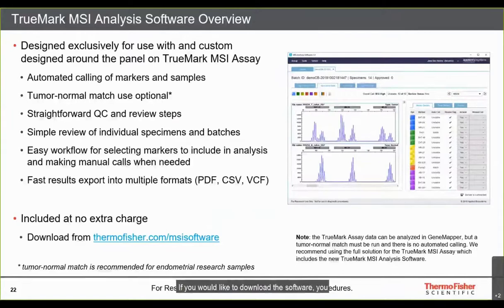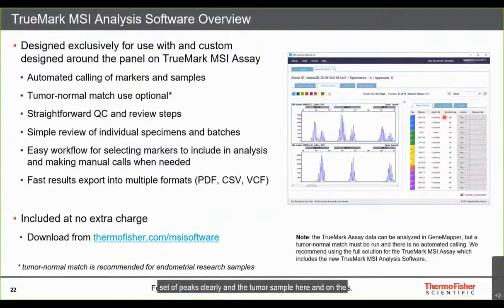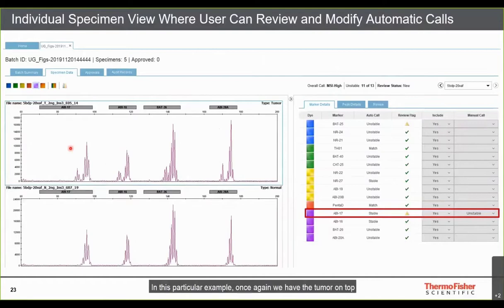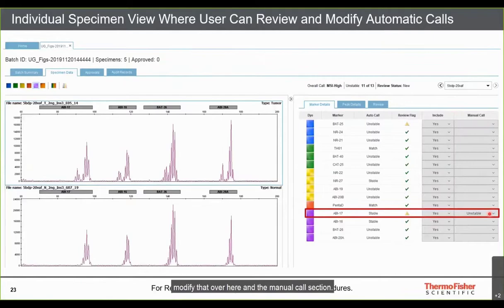A specimen data view shows three markers in the FAM channel with tumor on top and normal on bottom — extra peaks are clearly visible in the tumor. Automatic calls are shown on the right and can be manually overridden if needed. In one example, the algorithm calls ABI17 as stable, but a visual inspection reveals an extra set of peaks consistent with microsatellite instability, which can be corrected in the manual call section.